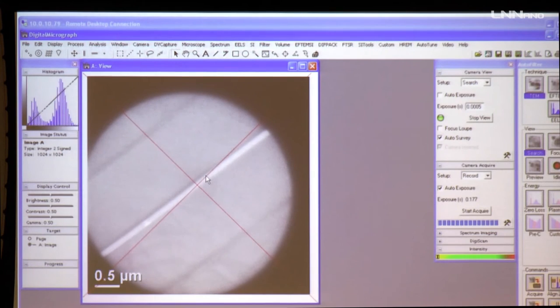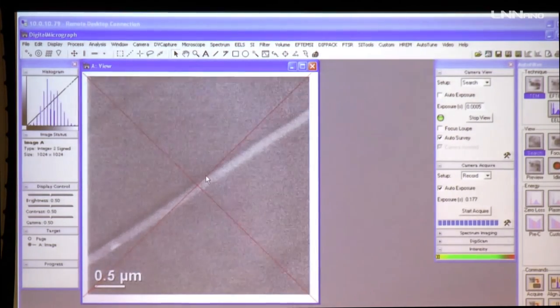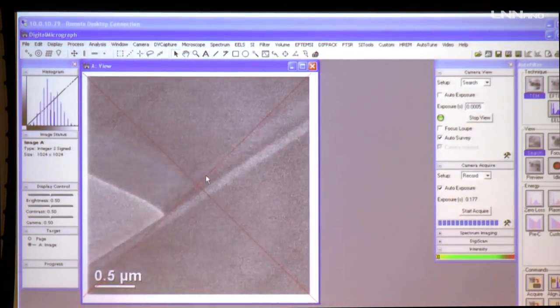There, you can expect a lot of amorphous region because the nanoparticles are placed on carbon film. Carbon is amorphous, so there it's easy to observe this effect properly. But now, as I have a bit of time, I will try to do it here.